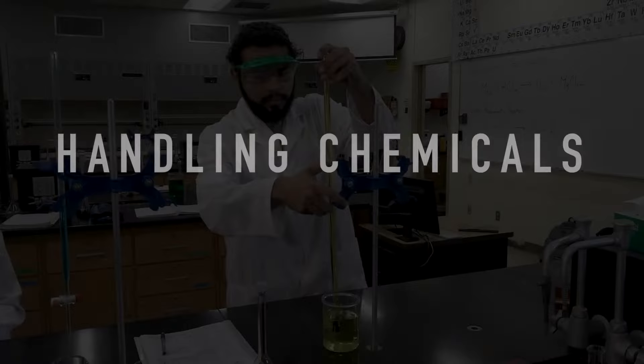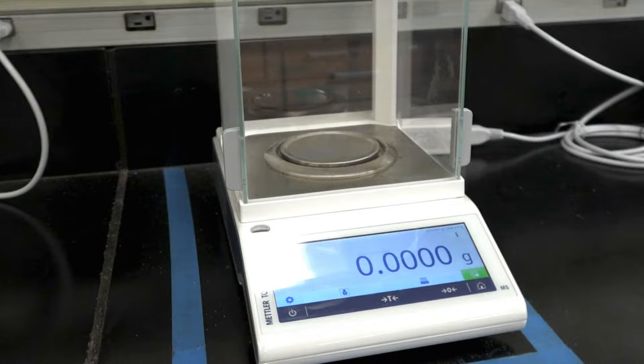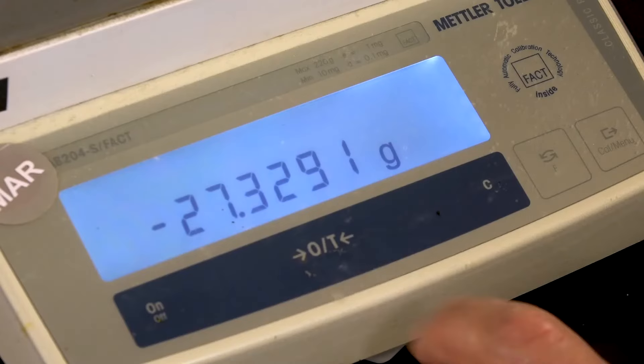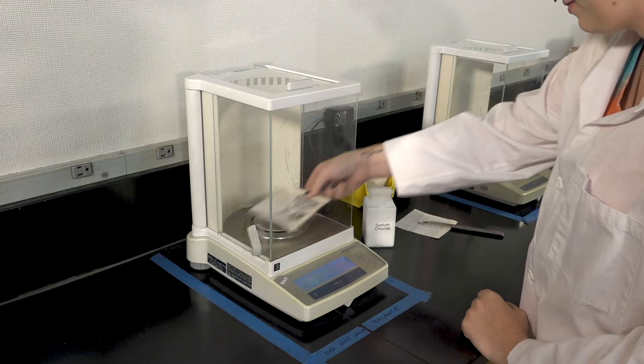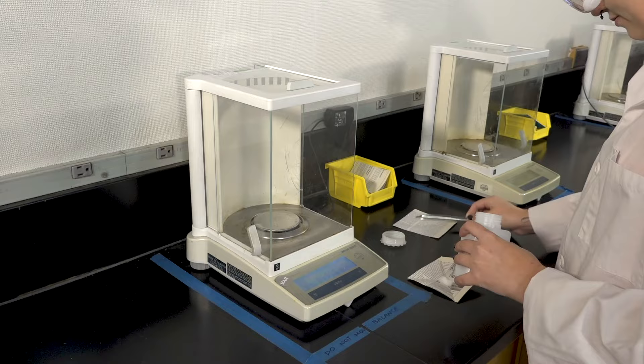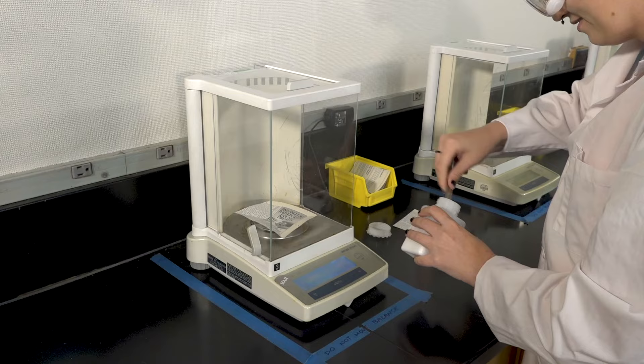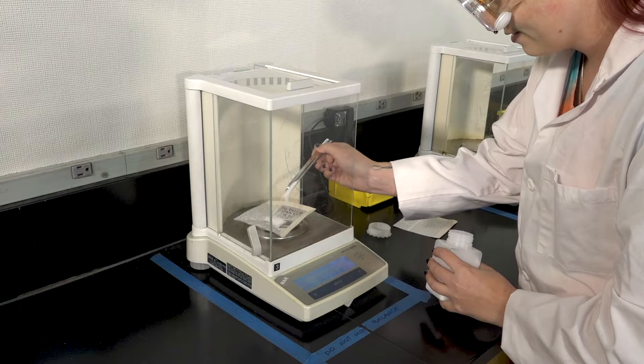One of the most exciting and dangerous parts of any chemistry experiment is the handling of the chemicals used in the experiment. The most common way of measuring the amount of solid substances is using the mass balance. Place your weigh paper on the balance and then press the tare button. The balance will now read zero because the tare button allows the balance to account for the mass of the paper. Remove the paper from the balance, transfer your solid to the center of the paper using a scoopula, then place back onto the balance and record the mass. Close all balance doors to get the most accurate reading. Never attempt to perform a transfer inside the balance as you are likely to spill. Balances are extremely expensive and these spills decrease the lifespan of a balance.